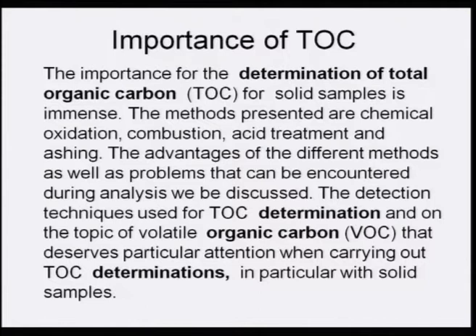Importance of TOC; we will refer to total organic carbon as TOC. The importance of determination of total organic carbon for solid samples is immense. The methods represented are chemical oxidation, combustion, acid treatment and ashing.